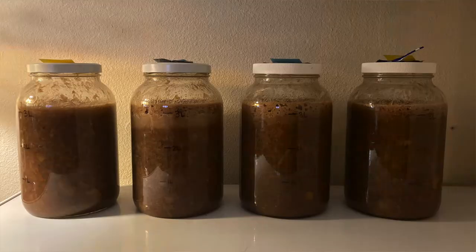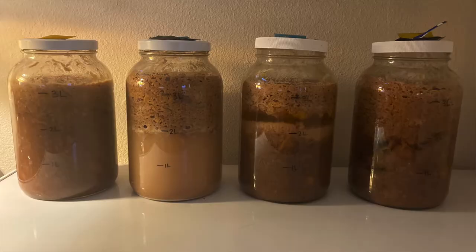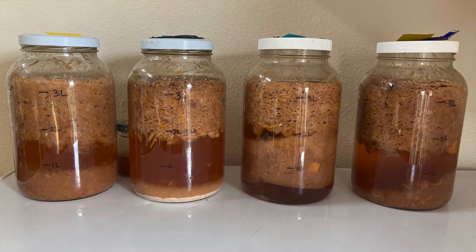But anyways, these have been fermenting for 6 days now, and immediately there was a difference in how they were fermenting. Even now, they are at all different points in the fermentation process, and I think that's so cool because each of these is a Saccharomyces species of yeast. The 4 different yeasts that I chose are, we'll go from farthest to closest to me. I don't know if that's left to right or right to left for you.